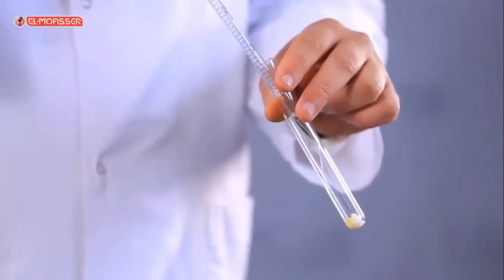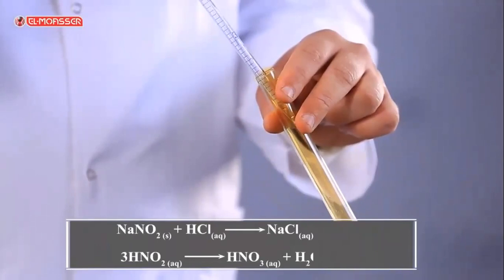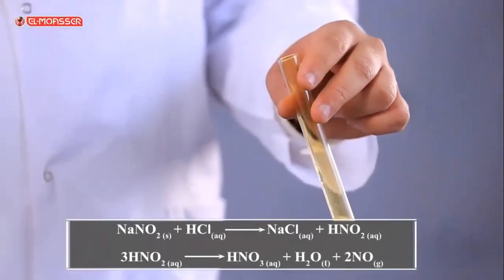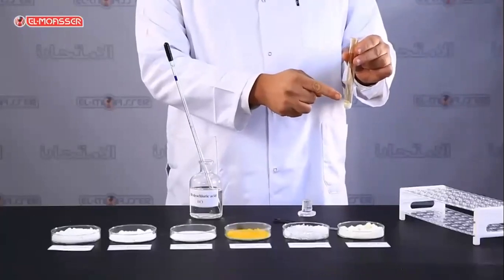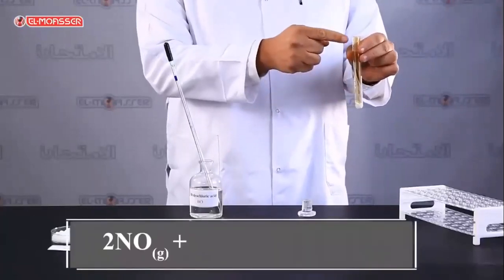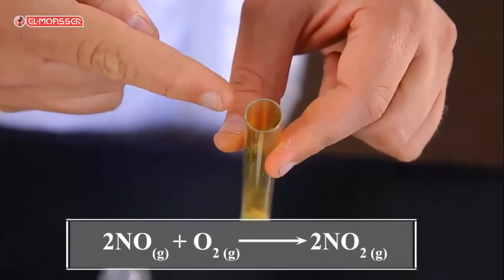What do you observe? A colorless nitric oxide gas evolves, which changes into reddish-brown nitrogen dioxide gas at the mouth of the tube.